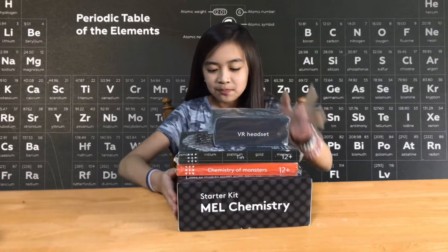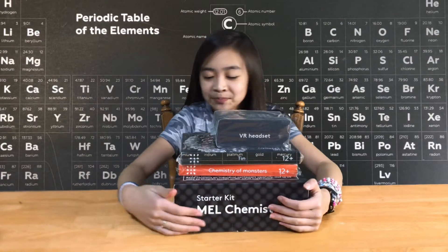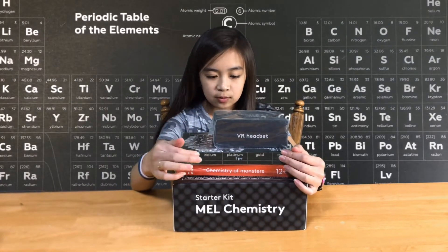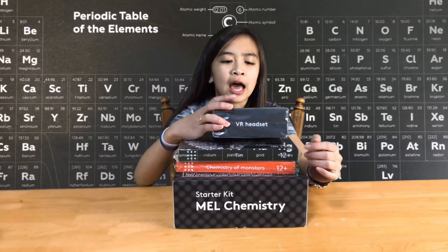Mel Chemistry sets! Thank you to Mel Chemistry for sending us these. We have the starter kit, the tin kit, this one right here, chemistry of monsters, and a headset.